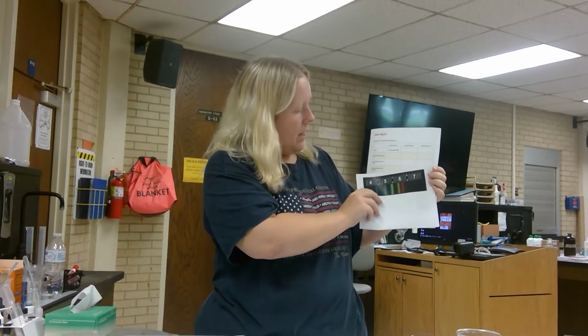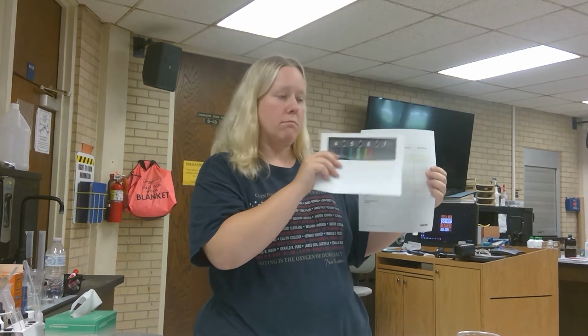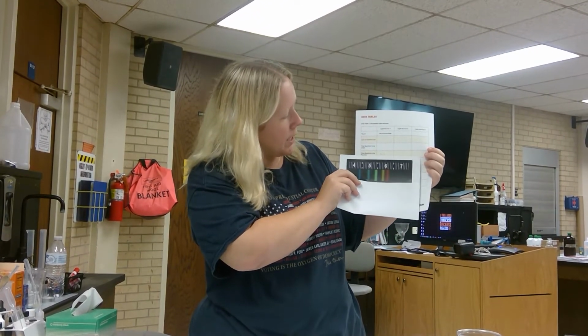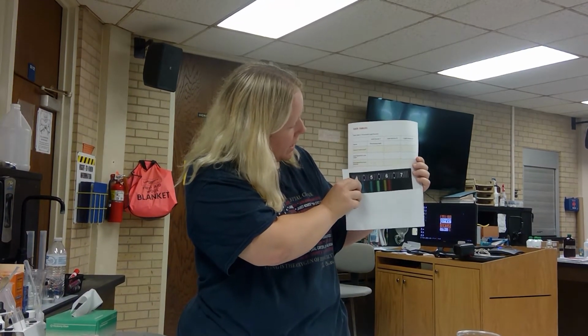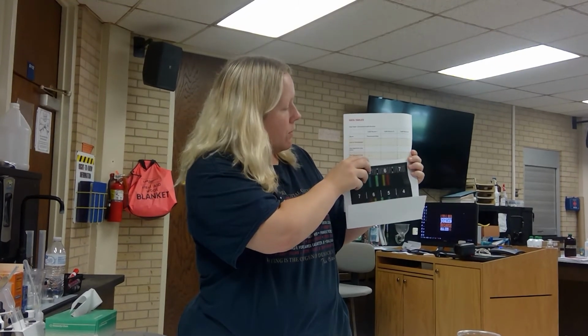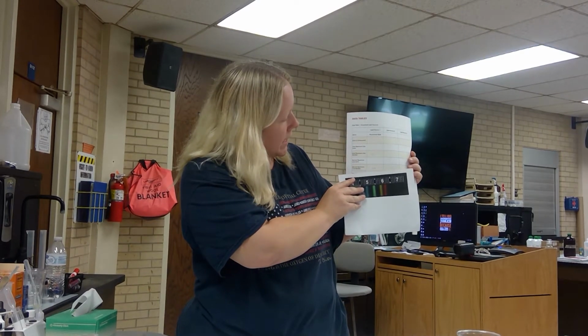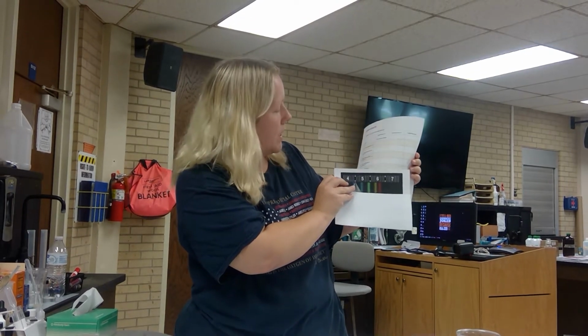First spectrum line color: I see violet, so I'm going to write violet on that line. First spectrum line number: if I read my scale, I read it at 4.4. So I'm going to write 4.4. Then I'm going to go down to second spectrum line color, turquoise, or teal.